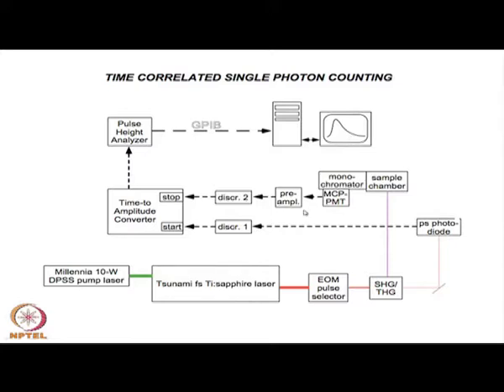So, this is quite an interesting method, and depending on the signal intensity, I mean fluorescence intensity, in some experiments you will find that it takes maybe 5 to 10 minutes to get sufficient counts. The point is that you need sufficient counts because it is a statistical averaging procedure. So, if you have more samples, then your experimental result will be more accurate and more acceptable.